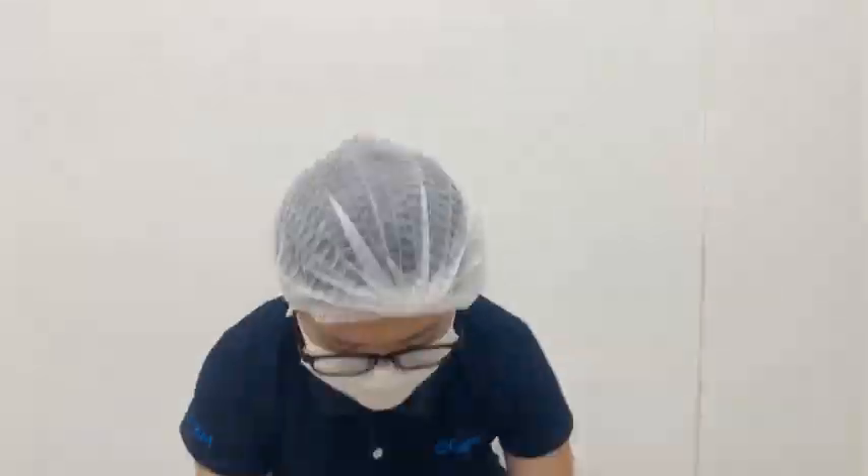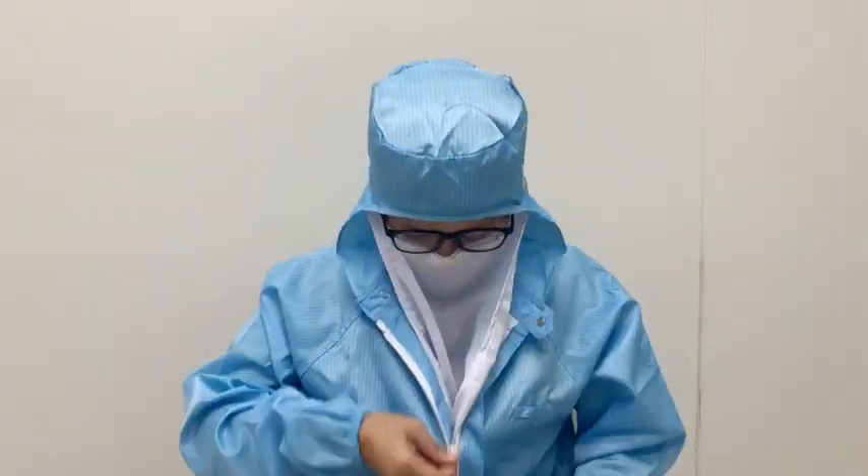Putting on Foamtech's foam face mask is easy. Simply loop the holes around your ears, covering your face. Be sure to follow your cleanroom SOPs during the gowning process.